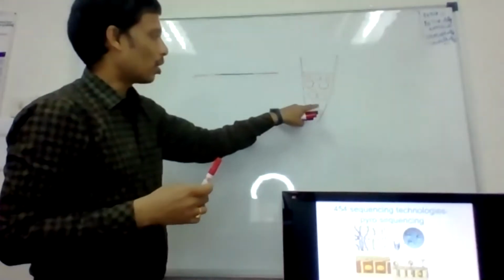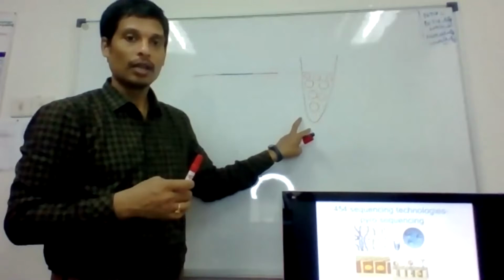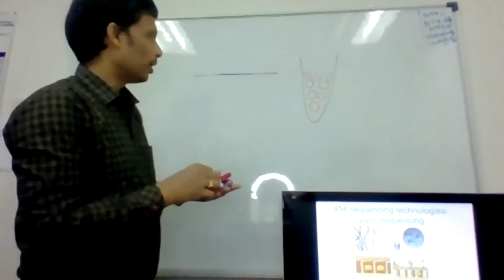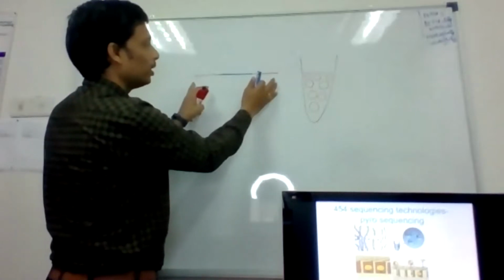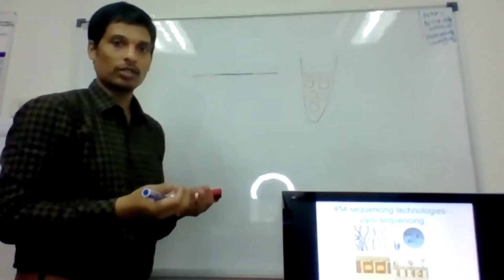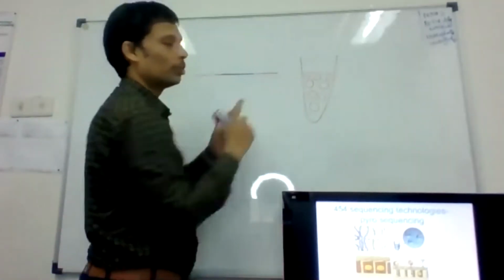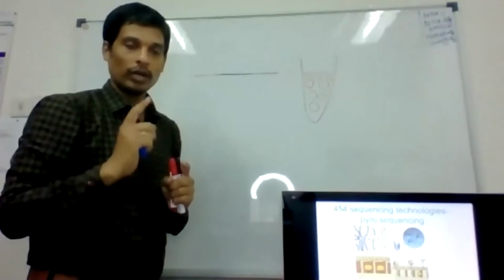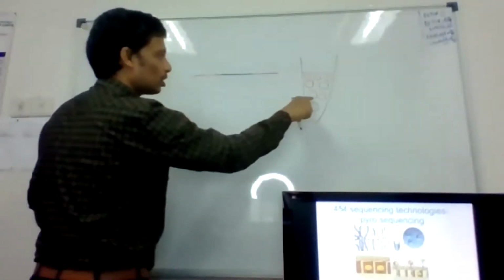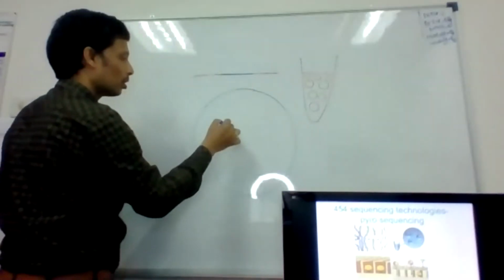These oil droplets are in the PCR solution, millions of droplets, and you add all the DNA to this solution in a ratio that is standardized such that each one will enter one oil droplet.